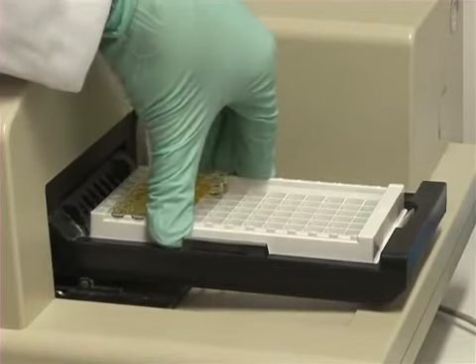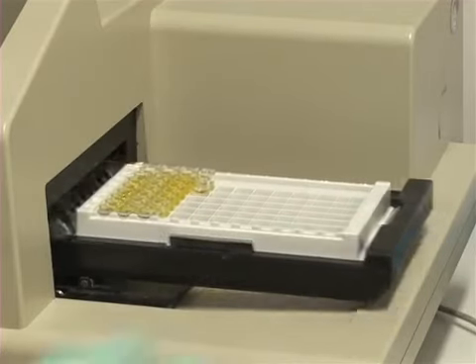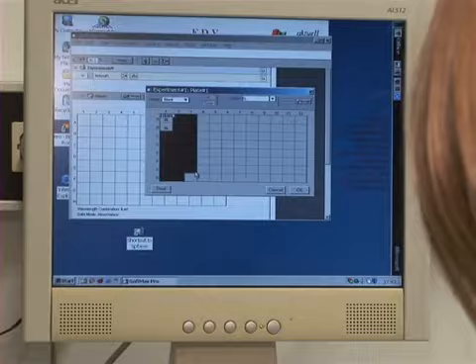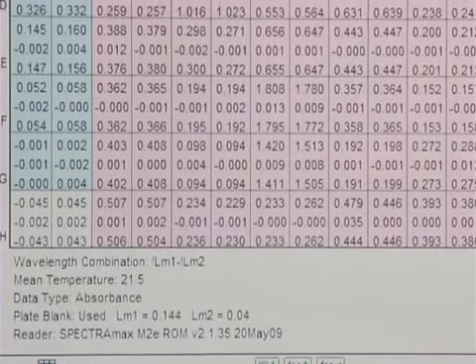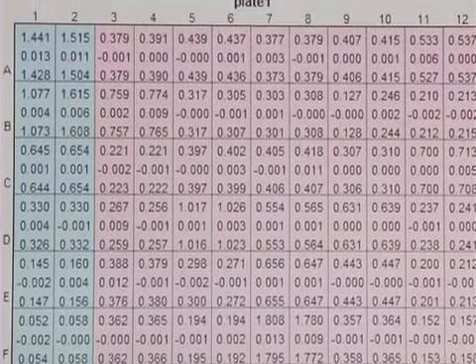Finally, place your plate in the microplate reader to measure the absorbance, or amount of colored solution, in each well. You will need to select which wells you want the reader to analyze. When the instrument is finished reading the plate, a readout of the absorbance for each well will be displayed.